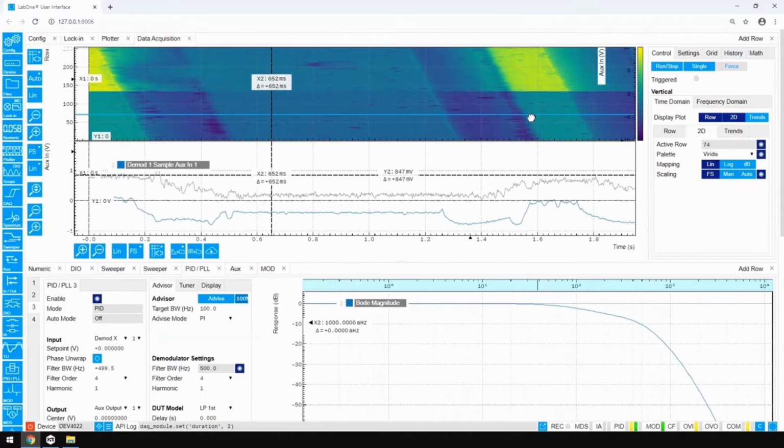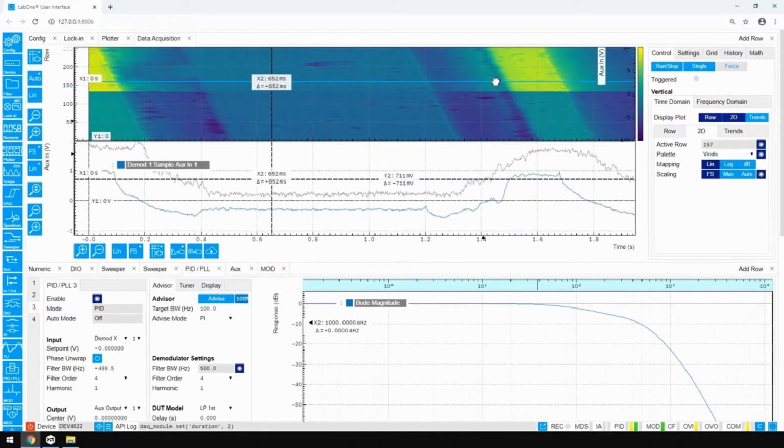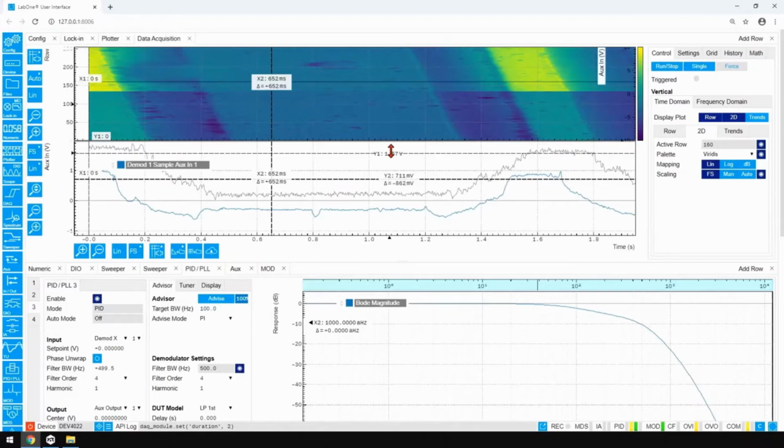And if you do the same for the heterodyne, this is this electrode, and then I move to a higher value. In this case, I measure closer to 1 volt, which is exactly what I have applied. So in this case, it's a bit more quantitative, because when I apply 1 volt bias, I measure this with this mode.